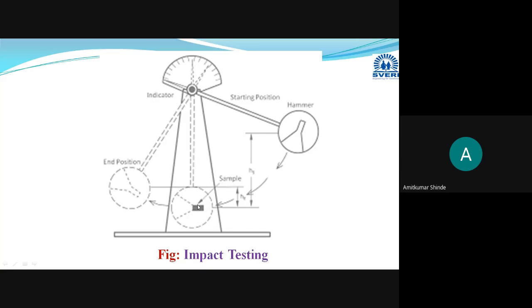on this specimen. During this procedure, we are going to take the readings related to the starting position of this hammer and the end position of this hammer.